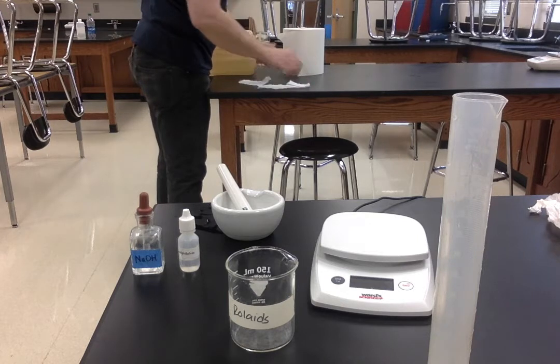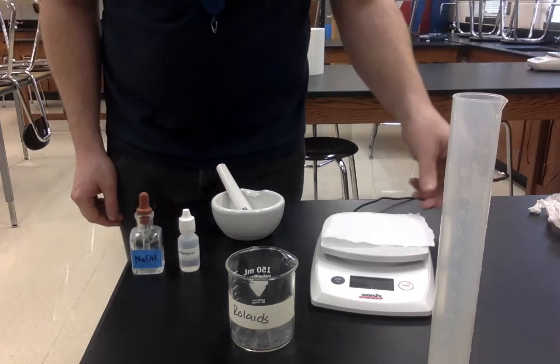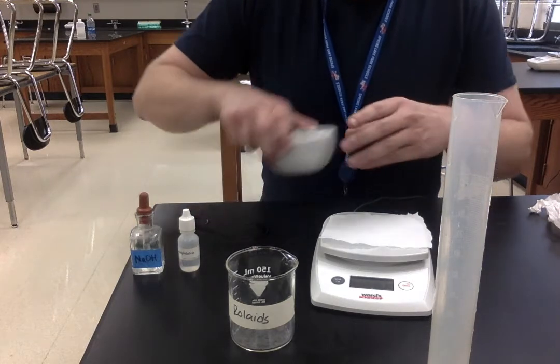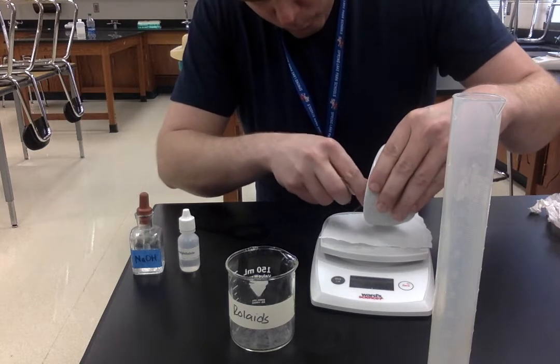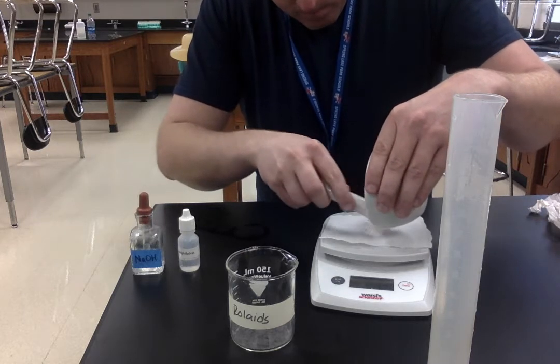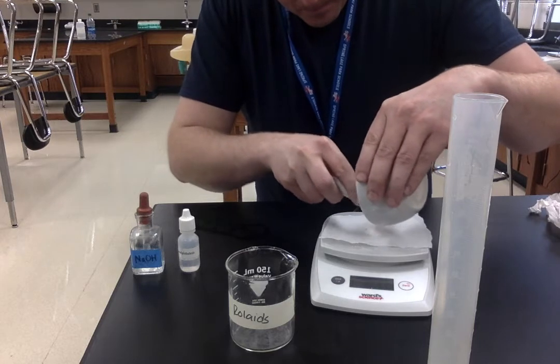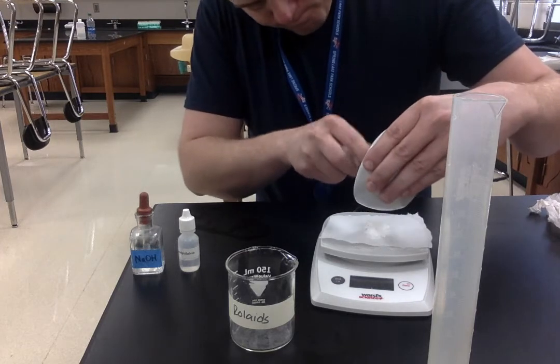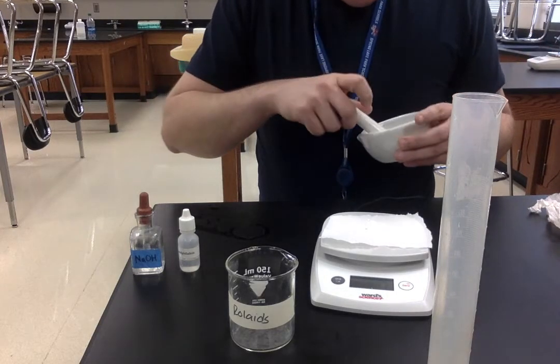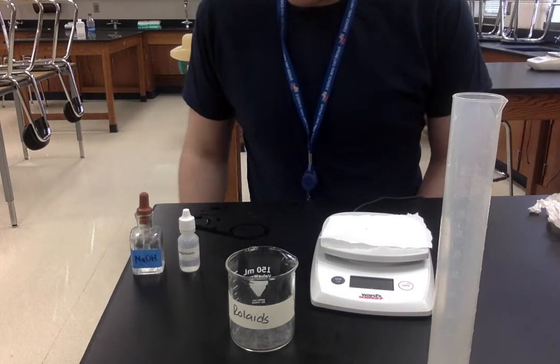Let's cut the paper down — don't need that much. Let's zero the scale, then add our powder. You can see that we were at about 1.7 grams, so go ahead and write that down.